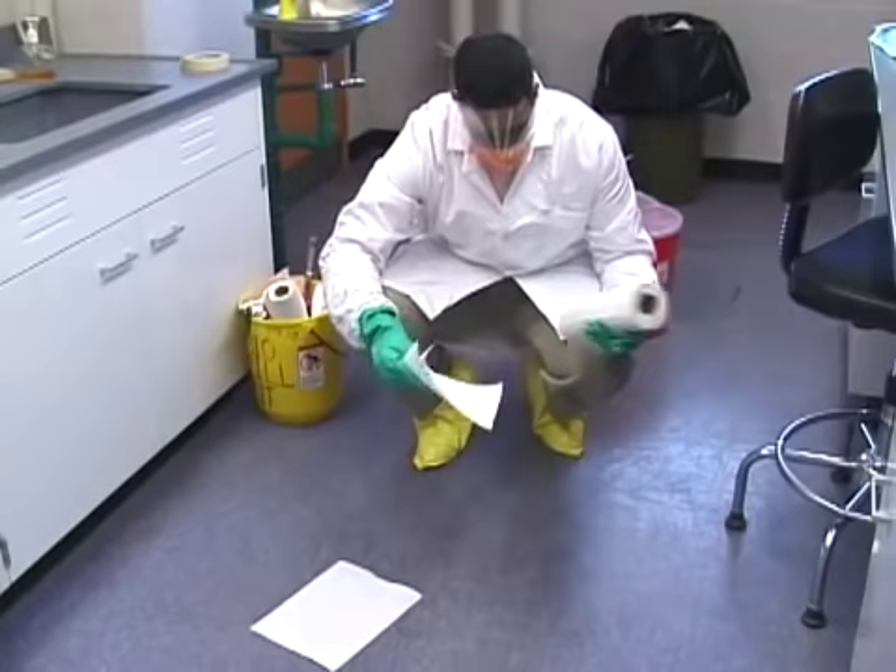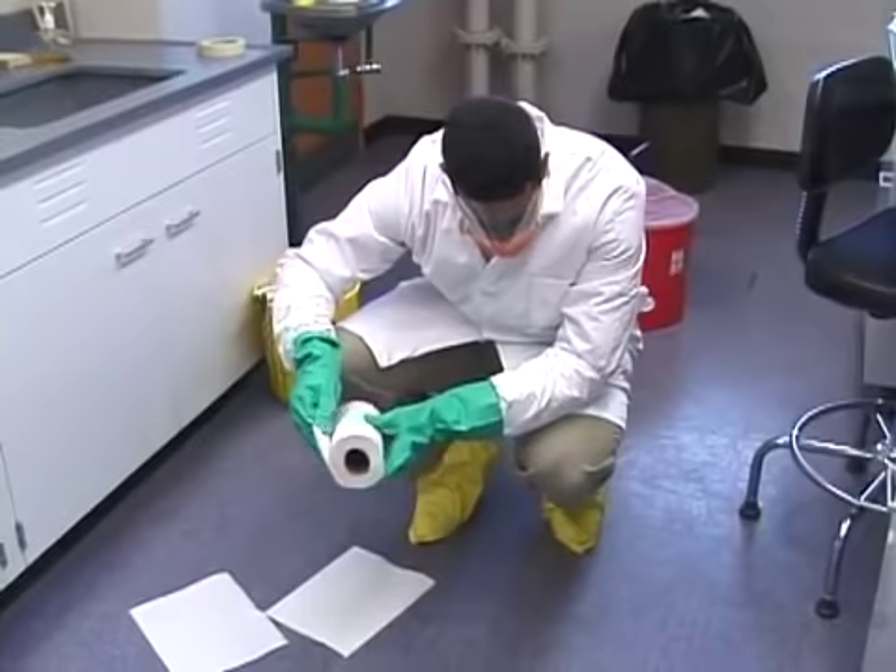When ready, approach the spill cautiously, laying paper towels or other absorbent materials on the blood-splattered areas.